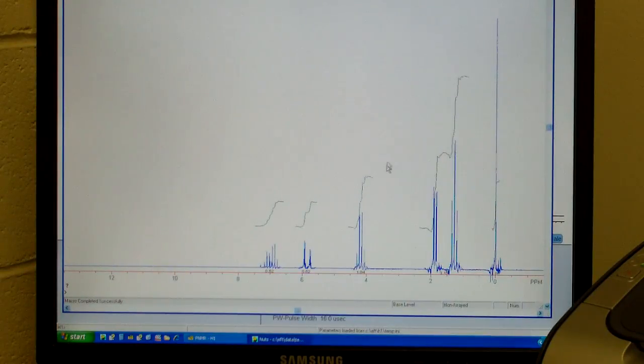Each of the peaks is integrated, but you can see in this particular example we've got two peaks that are integrated together. This is one of the reasons why I think we can do better than to integrate them together. So I'm going to describe how you integrate those individually and even assign numbers to those peaks that make sense to you.